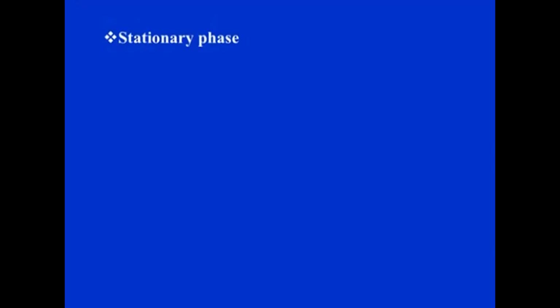Now, attached to these matrices is the stationary phase, which is involved in the purification process. The chemical nature of the stationary phase depends upon the particular form of chromatography to be carried out. Say if it is ion exchange, you will be immobilizing ionic groups, if it is affinity, affinity ligands, and so on. Most stationary phases are available commercially attached to the matrices in a range of sizes and shapes. Both size and shape are important because they influence the flow rate and the resolution characteristics.